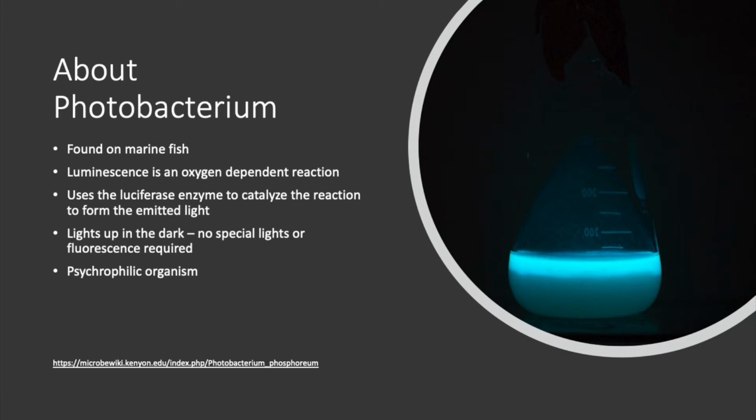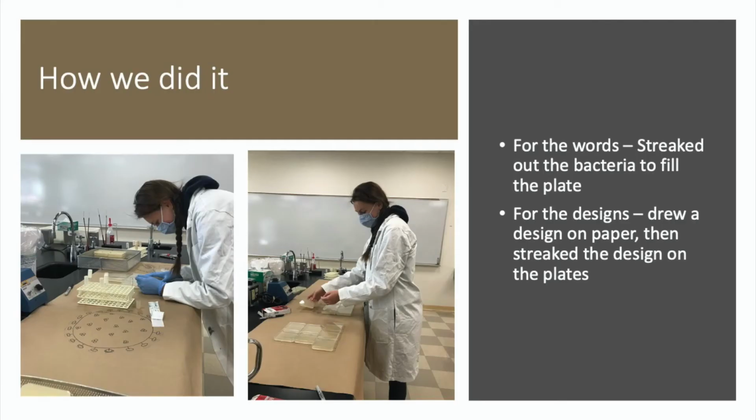This organism lights up just in the dark. It doesn't require any special lights or fluorescence to see the light emitted from the organism. This organism is also psychrophilic, which means it likes the cold. So when we incubated the bacteria for this project, we didn't put it in an incubator or anything. We actually put it in the refrigerator.